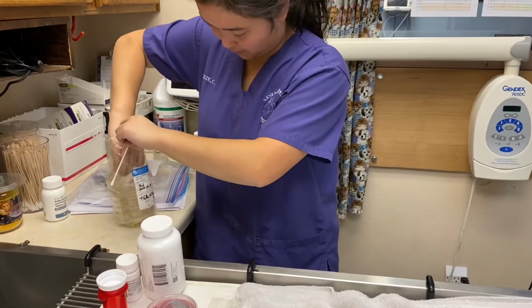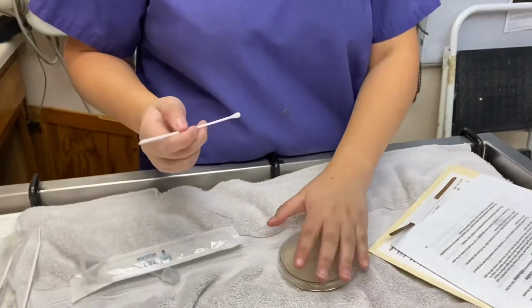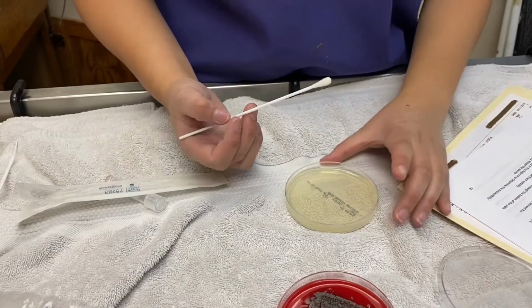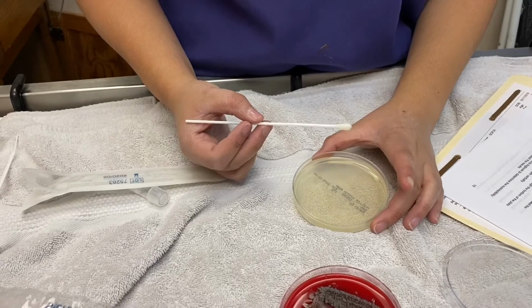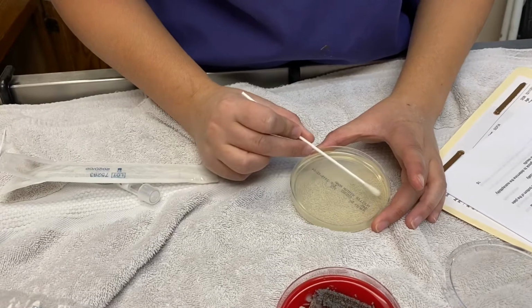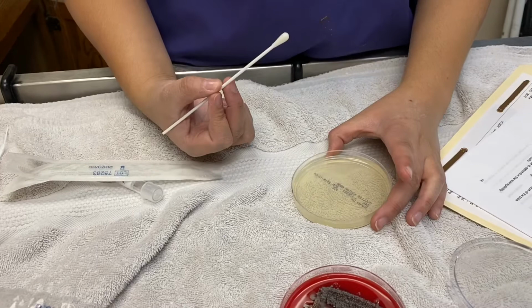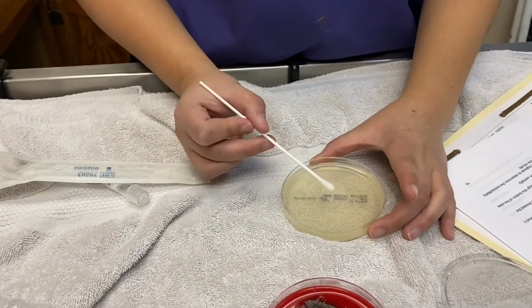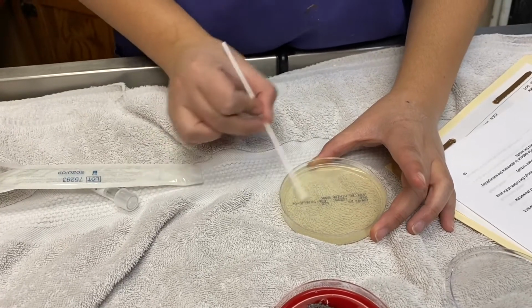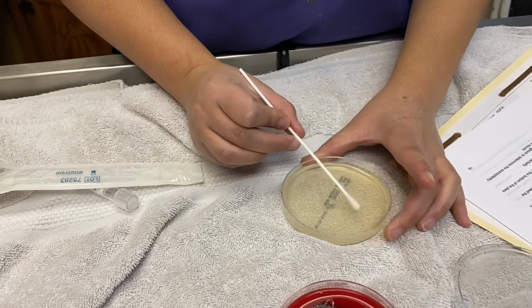Okay, and then I have my regular Mueller-Hinton agar plate. I'll swab the whole plate, the entire surface of the plate. And then rotate it about 60 degrees and swab the whole plate again. Then rotate it again 60 degrees, and rotate it again.